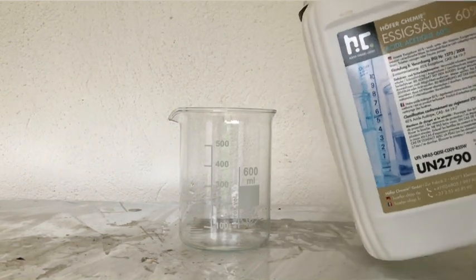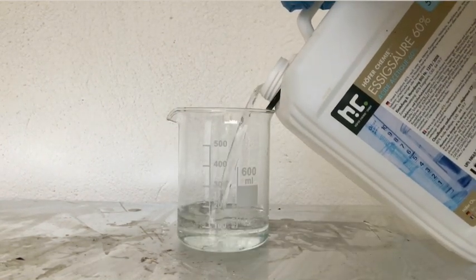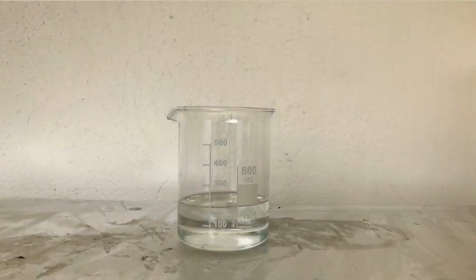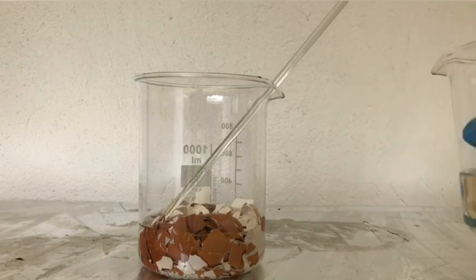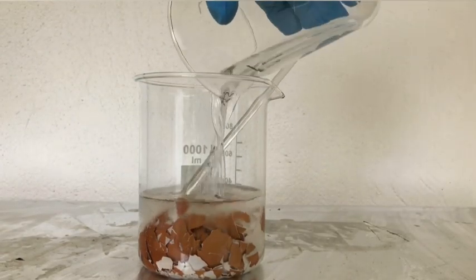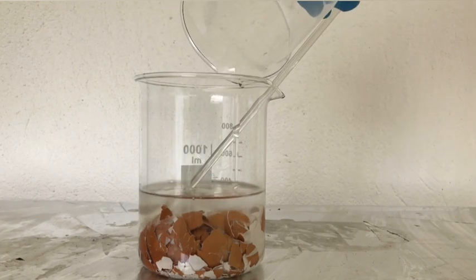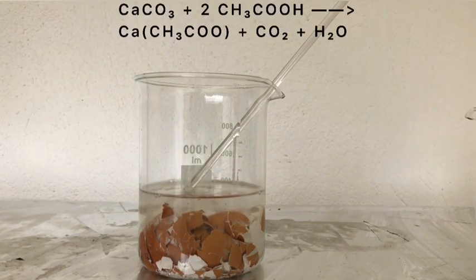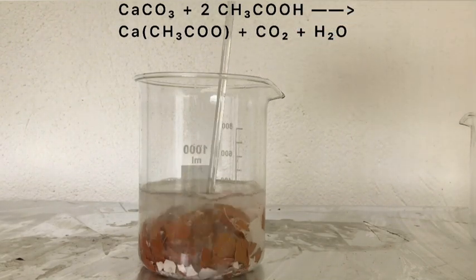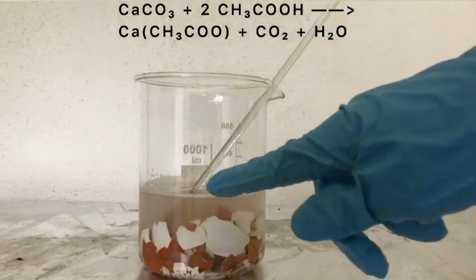Afterwards, approximately 200 milliliters of 60% acetic acid were measured out. These were then simply added to the eggshells. You can see that immediately a reaction starts, because the calcium carbonate in the eggshells reacts with the acetic acid to form calcium acetate, water, and carbon dioxide, which you can see here.